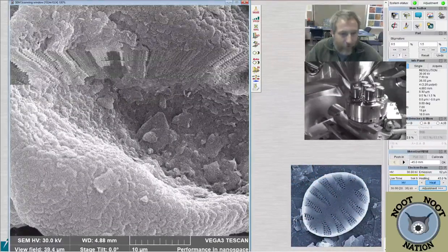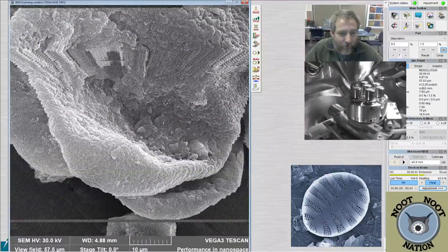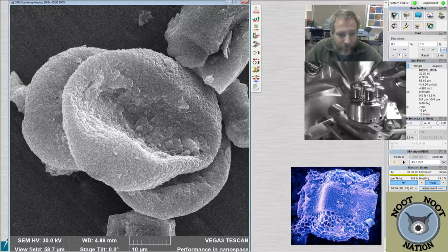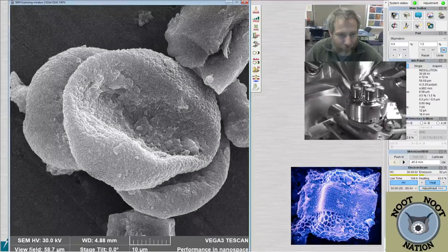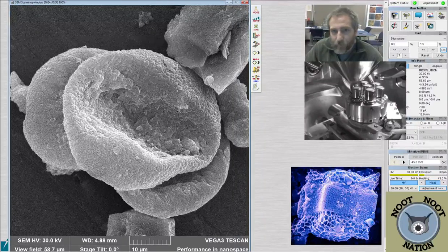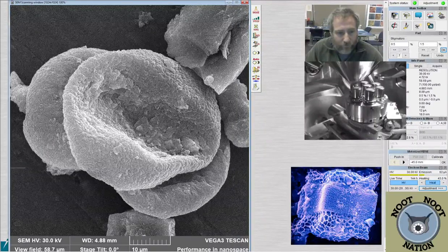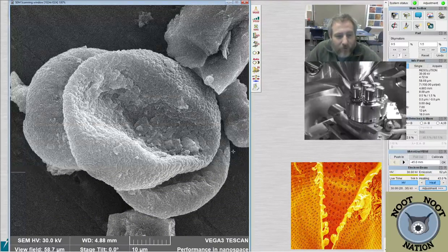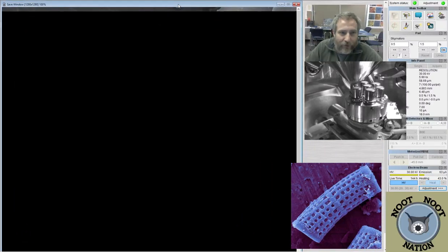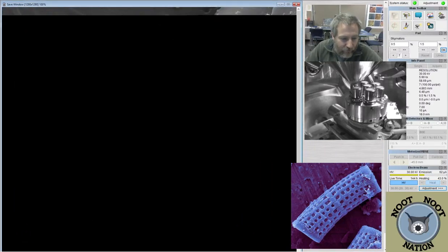I will take a picture of the pine pollen just for fun. It might be something that we would want to include in an analysis, but probably pine pollen's not going to tell us a whole lot, since we already know there's pine here. But it's sometimes nice just to collect some images of other things that we find in the sediments, in the record, and to have some image of them for training for students so that I can show them what pine pollen looks like.